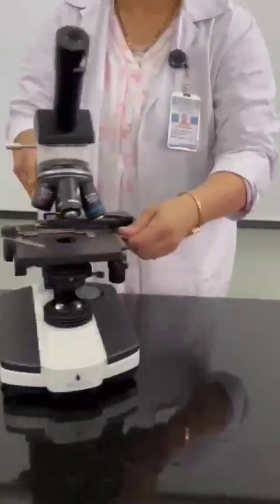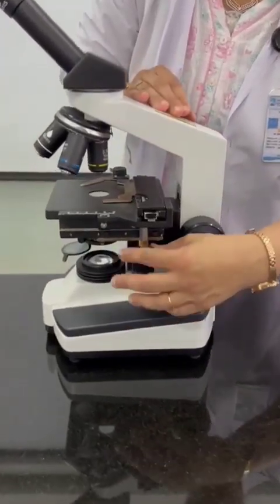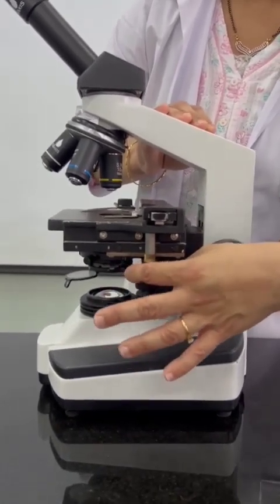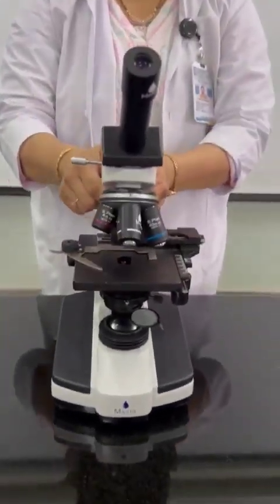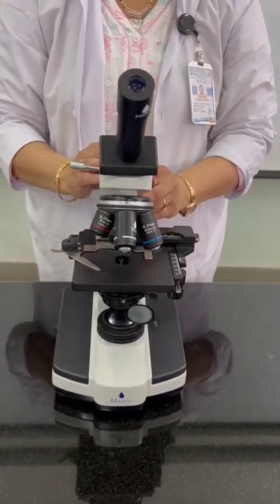Along with this, we also have screws for the stage. These screws will help to move the stage, the clips of the stage, forwards and backwards and from side to side. This will also help to bring the specimen or the area of interest in focus.